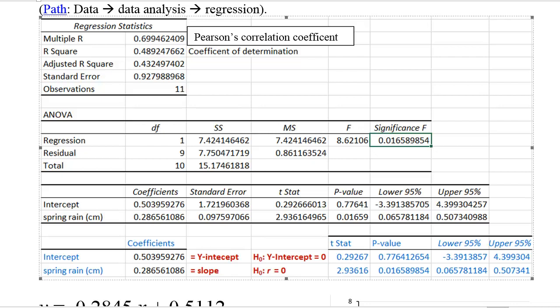Hello, this is Stokes Baker. Today I'd like to talk about how to use Microsoft Excel to perform linear regression analysis.